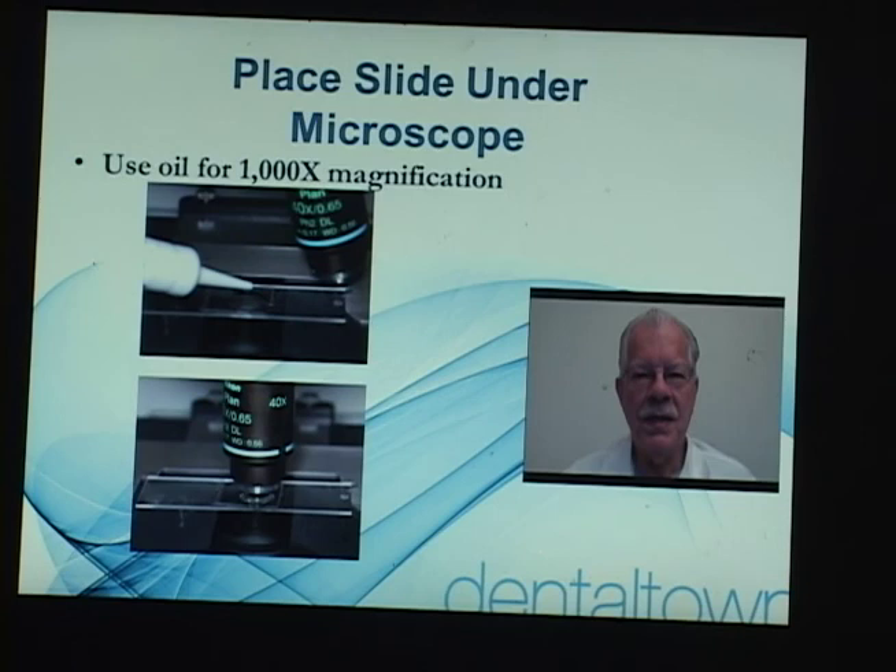Now we're placing the slide and the bacteria sample into the microscope. Many use 400 power. I use 1000 with phase contrast and oil immersion because I like to be able to see even the smallest spirochetes. We find many samples that until you get to 1000 power you can't see the spirochetes. It's good to get a very good quality microscope with good lenses — it's better to cry once than cry many times if you buy the wrong microscope.